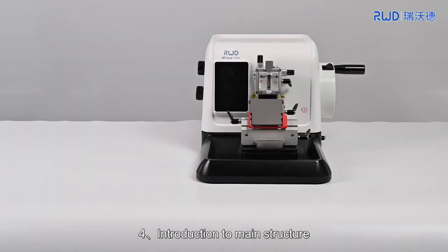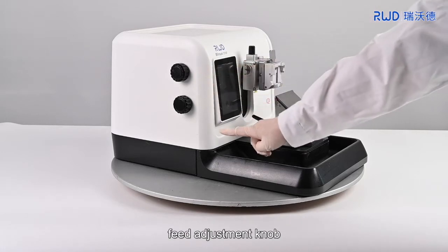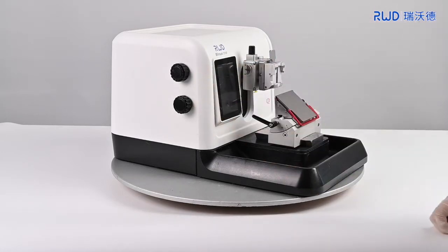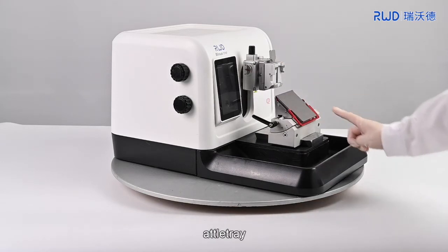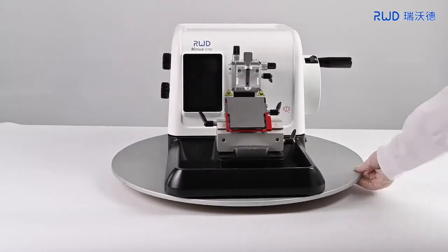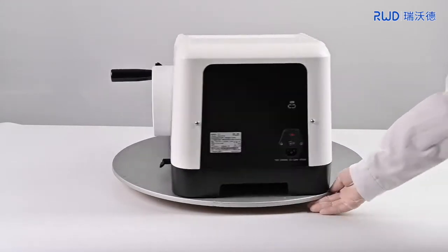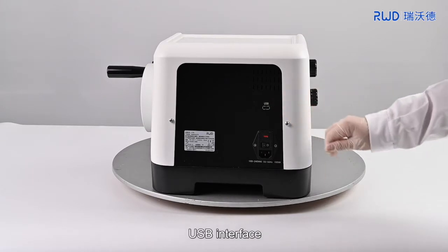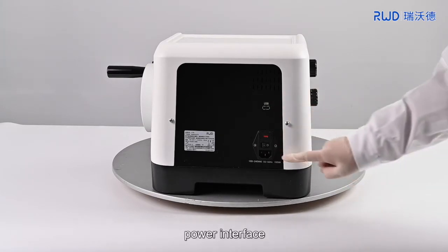4. Introduction to main structure: parameter adjustment knob, feed adjustment knob, touch screen, specimen fixing system, blade carrier, Addle tray, hand wheel, hand wheel lock, USB interface, fuse, power switch, and power interface.